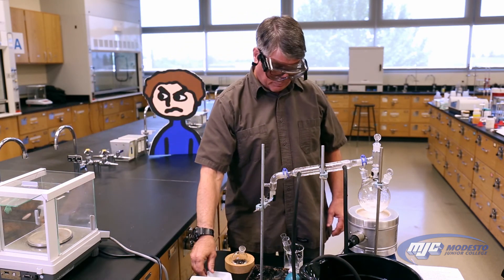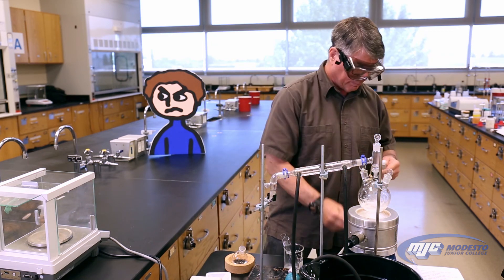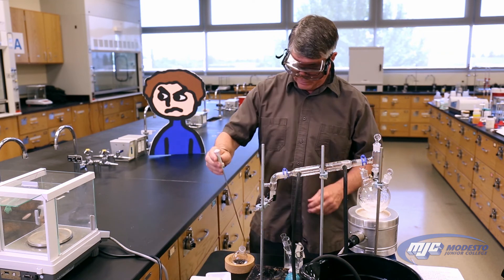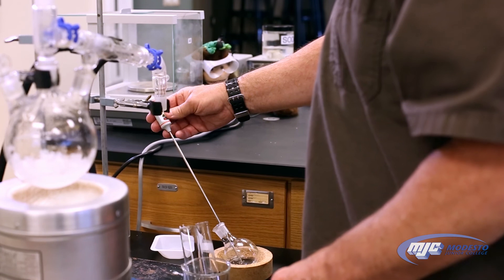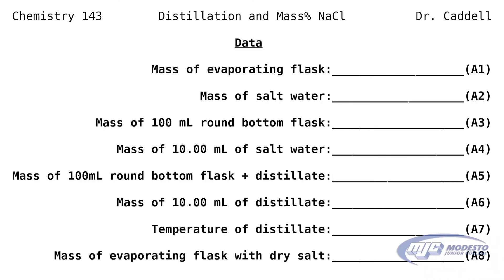Now what we have to do is measure the temperature of our distilled water. So we're going to take a digital thermometer, turn it on, make sure it's on degrees Celsius, and record this temperature. This is one past the decimal in degrees Celsius. This is going to be A7.